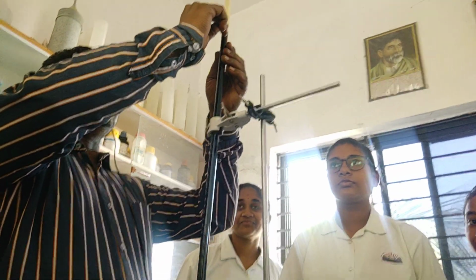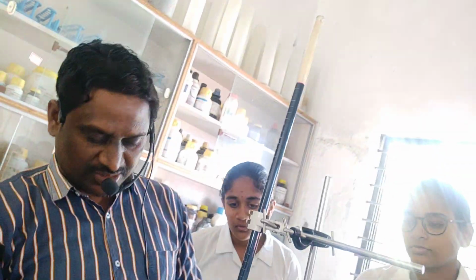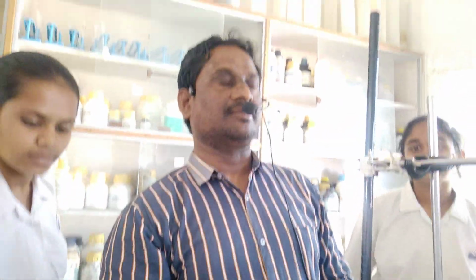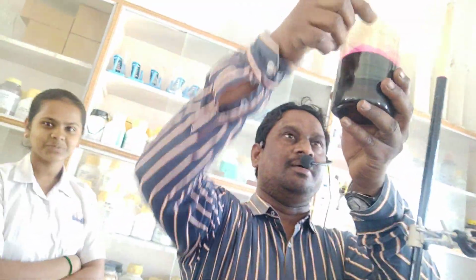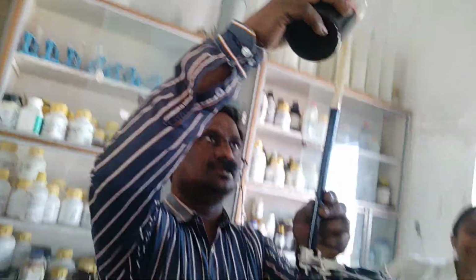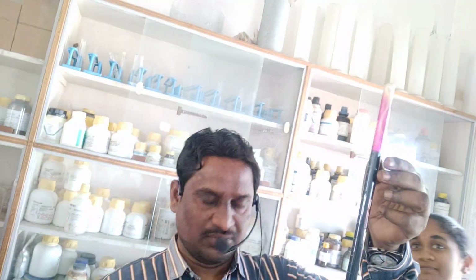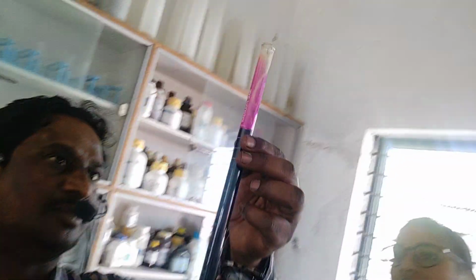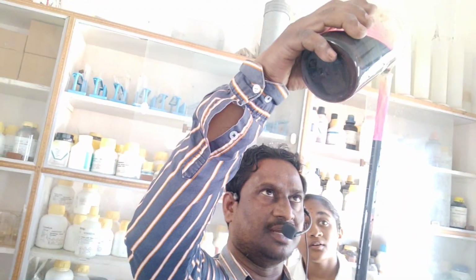There potassium permanganate. So while we are doing this, you observe here clearly. The starting reading is 0 and the ending is 50 here. Are you understanding? So from the start we'll fill this one and give it to you. Potassium permanganate will be filled slowly, up to exactly 0, and then given.